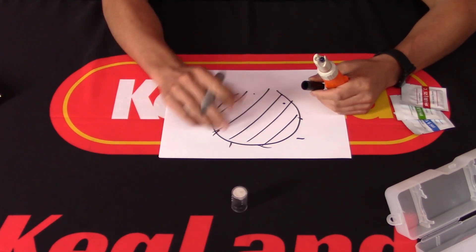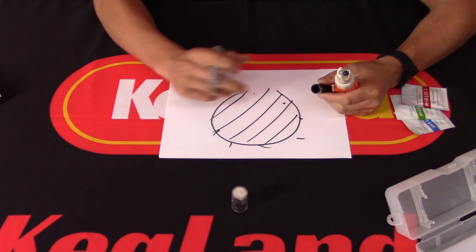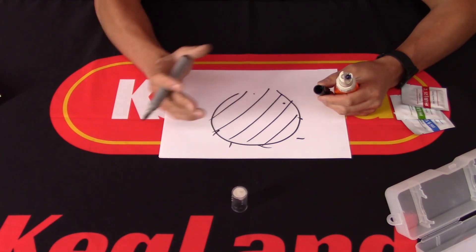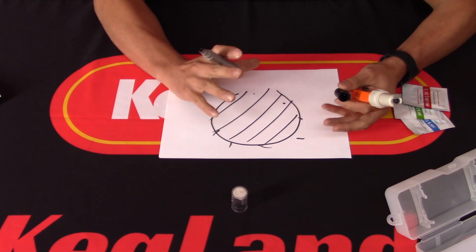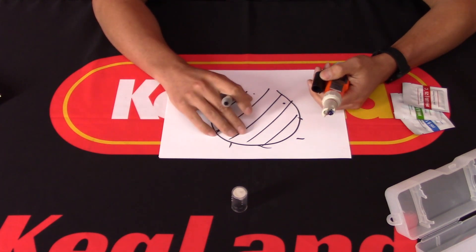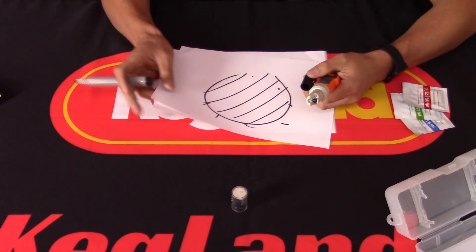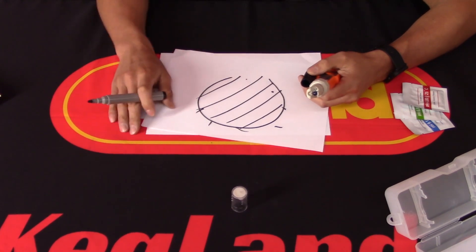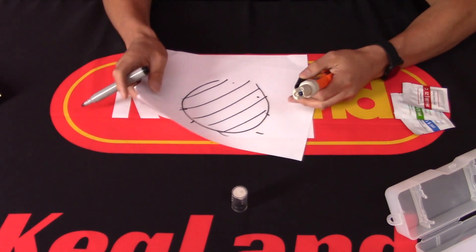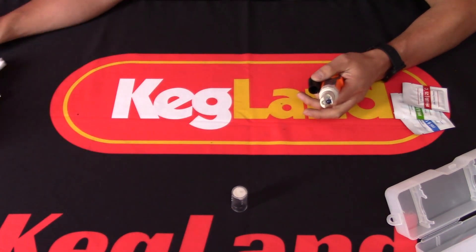When you use the probe under really tough conditions — like sticking it into boiling hot wort — that can put a lot of pressure on the probe and cause damage very quickly. For those reasons, we wanted a pH meter with replaceable probes from a supplier that stocks them. You will eventually damage the probe — it's just a matter of time — and some relatively highly-priced meters don't even have replaceable probes, which was a specification we really wanted to include.